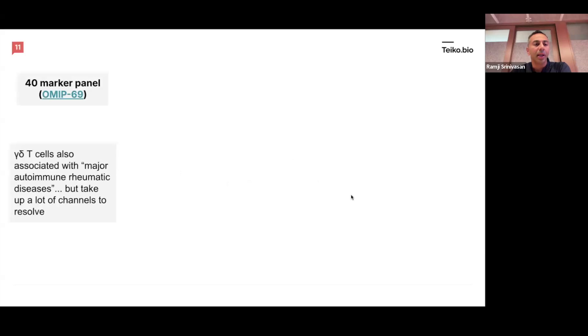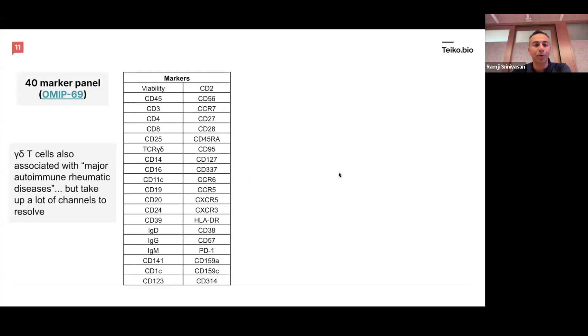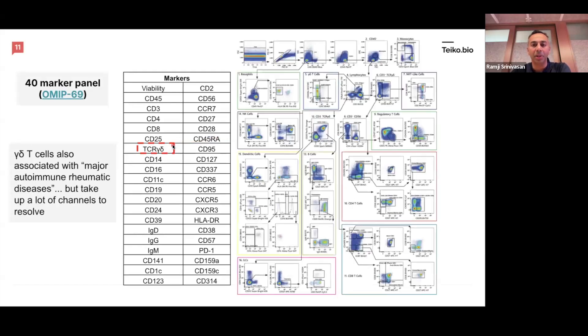So let's see this in action. This is a 40 marker panel that came from OMIP-069, and the researchers mentioned gamma delta T cells, which are associated with major autoimmune rheumatic diseases. We covered this in a previous spectral flow webinar. They basically take up a lot of channels to resolve. This was the 40 marker panel they used, and you can see our friend gamma delta over here. And if you go to the actual gating plot, which is quite complex, you need to get to many cells, 1, 2, 3, 4, 5, 6, 7, 8, around there to get to gamma delta T cells. So it's quite complex to actually resolve this.